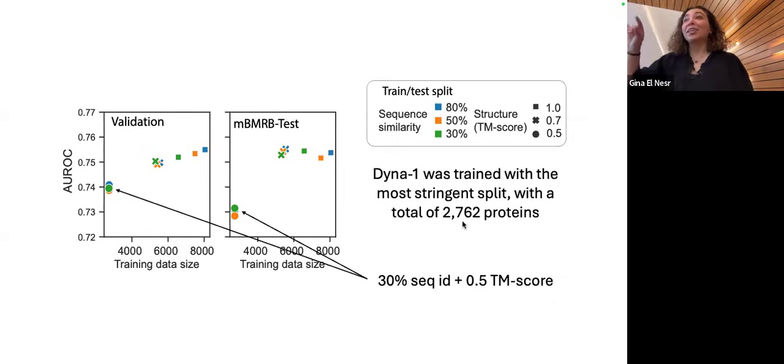And then the other thing is that the performance didn't change whether we shoved all the data into the model or not. And this means it's a hard problem, both because maybe the assumption that we need more data isn't right in that time regime, but maybe also the model representation isn't sufficient to be capturing this time scale.